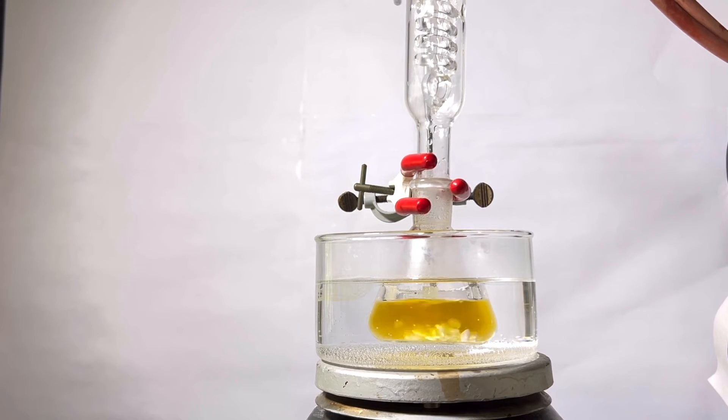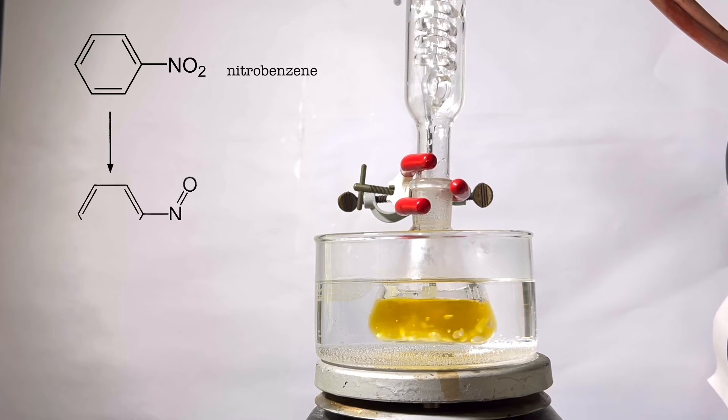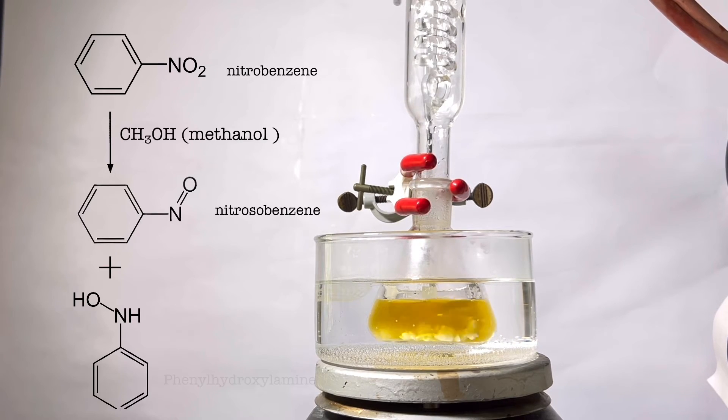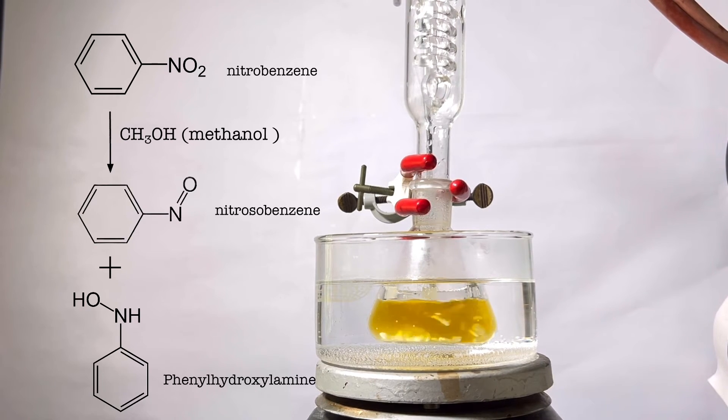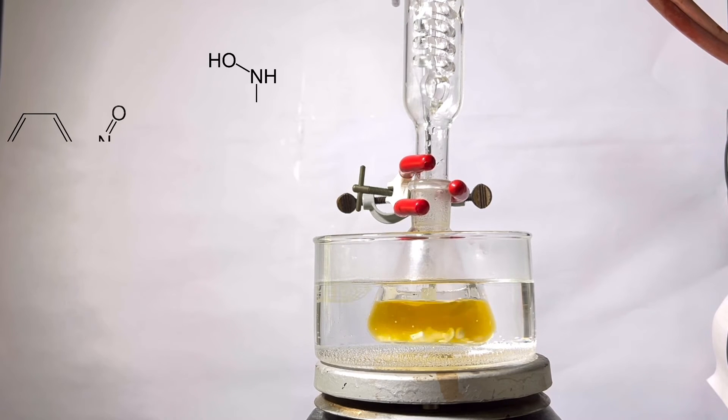While it is getting refluxed, let us go through the chemical reaction that is going on here. Nitrobenzene is partially reduced by methanol to form the intermediates nitrosobenzene and phenylhydroxylamine. Later, the intermediates nitrosobenzene and phenylhydroxylamine condense to form the product azoxybenzene.